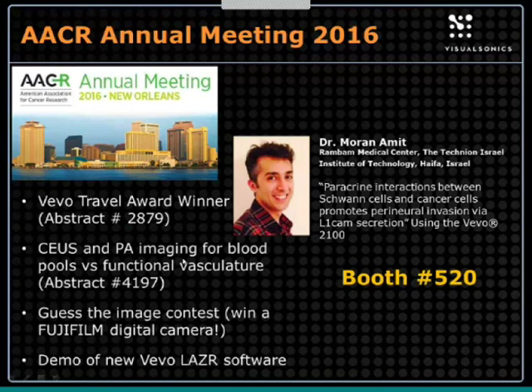Another abstract I want to point out is using contrast-enhanced ultrasound and photoacoustic imaging to look at blood pools versus functional vasculature.